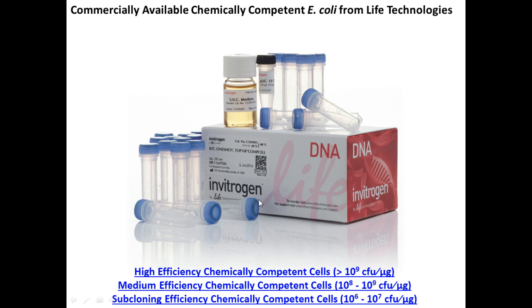There are different kits that you can buy commercially if you're working in a research laboratory. And there are different levels of what we refer to as efficiency, how good they are at taking up the DNA. So there are, of course, highly efficient ones, medium efficiency ones, and ones that are used for subcloning.